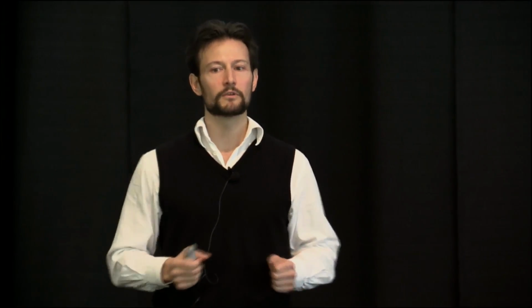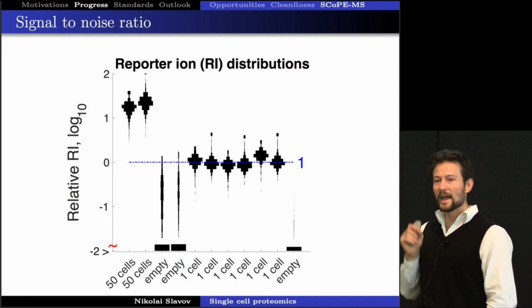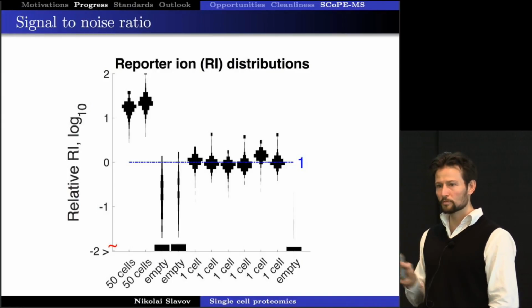Now, there are 2 aspects to it. One is technological, which is the way the Orbitrap works: whether we can do a comparison between 2 ions that differ by an order of magnitude or more. And there is something iffy about that I don't fully understand. The good thing is that I don't need to understand it entirely, because in our single cell quantitation we never take a ratio between the carriers and the single cells. We only take ratios between the carriers or between the single cells, material with similar abundance. And this is by far the smaller aspect, the instrument, the Orbitrap, the technological.